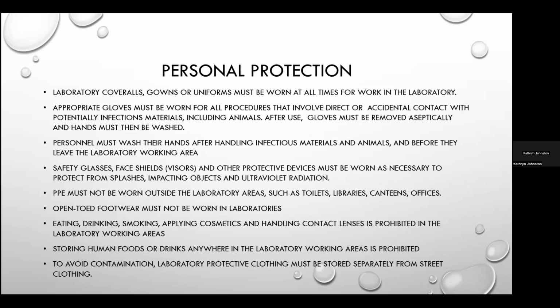PPE should never be worn outside the laboratory, and this includes the lab coats that are worn while working at the bench. Eating, drinking, applying cosmetics, and handling contact lenses pose a significant risk of disease transmission and should never be allowed in the work area. Tea and lunch breaks should always be taken in a separate area outside of the work area. And food and drink should never be stored in lab refrigerators, and they should be stored in a separate refrigerator in the tea room.